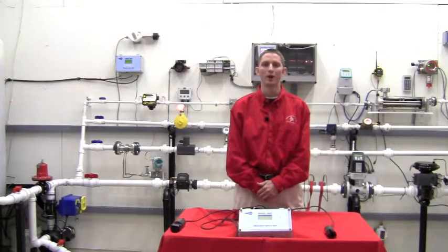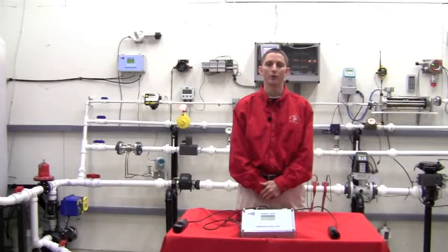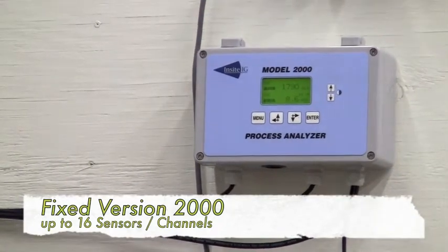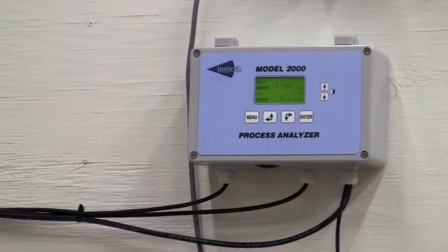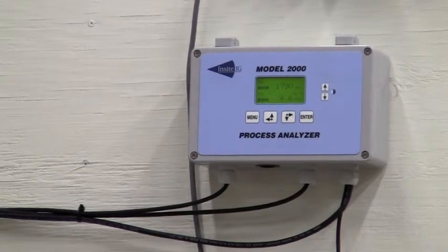Insite has a full line of dissolved oxygen and total suspended solids monitors including our fixed version, which comes in 1, 2, 4, 8, or 16 channels with a separate 4 to 20 milliamp output for each channel. We also have a separate sensor for dissolved oxygen or total suspended solids, as well as an inline and hot-tappable sensor.